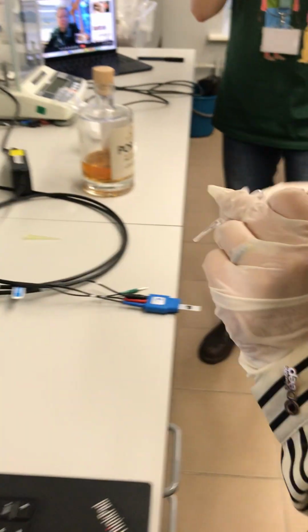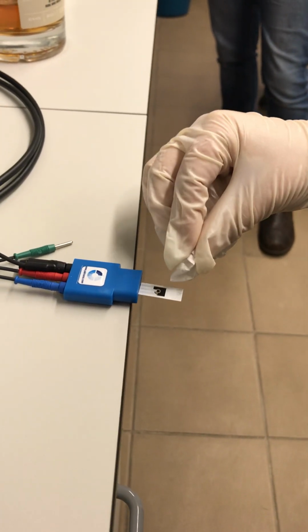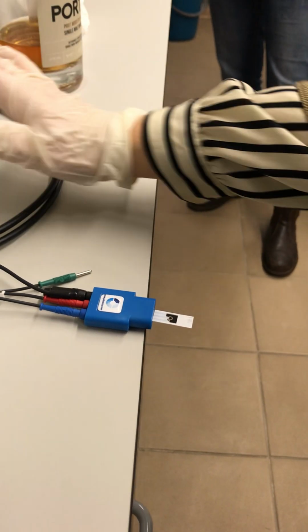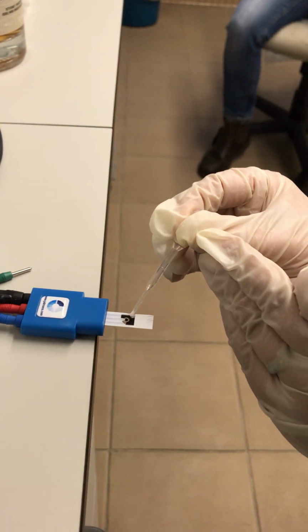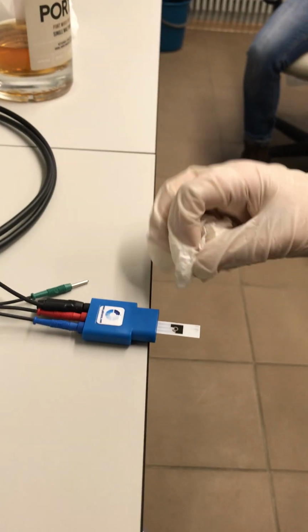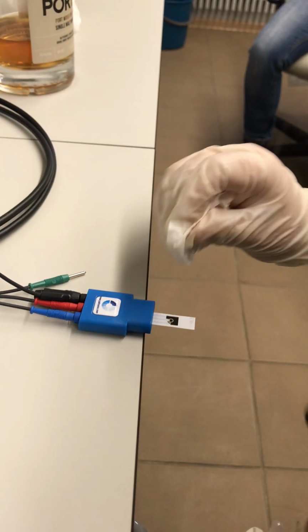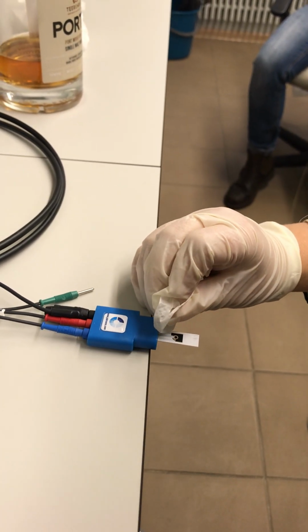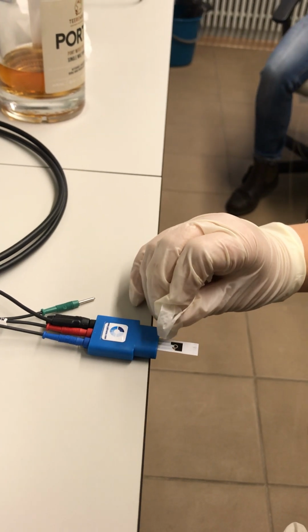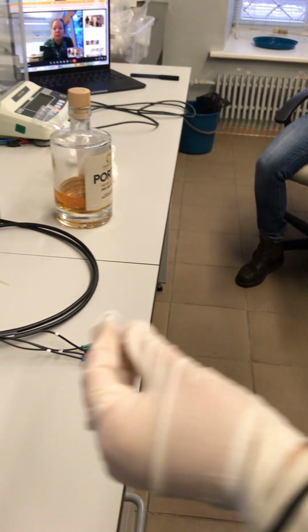This step is important to clean the surface of the electrode from whatever samples we had before. A bit more ethanol, that's it. I think it should be okay. It's very high concentration ethanol. It evaporates fast. And now we are going to have the sample.